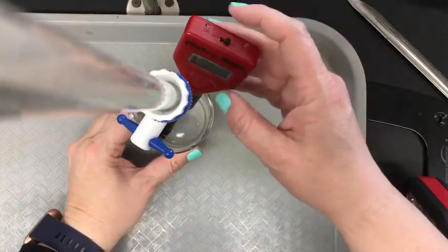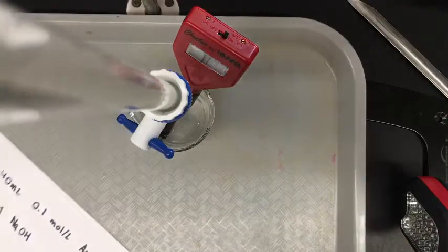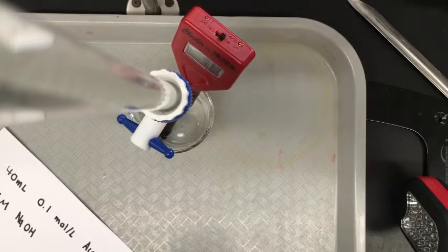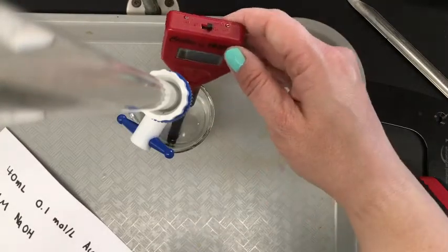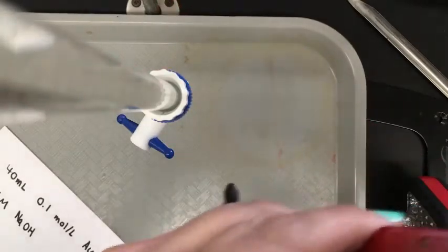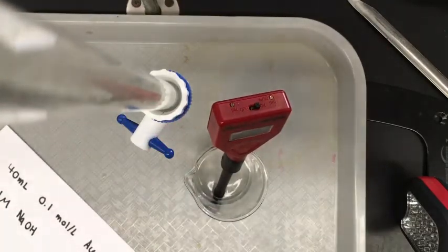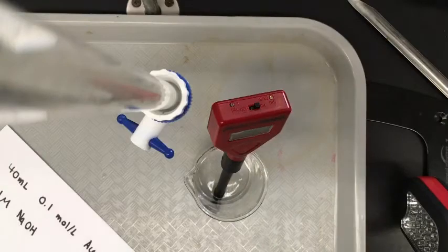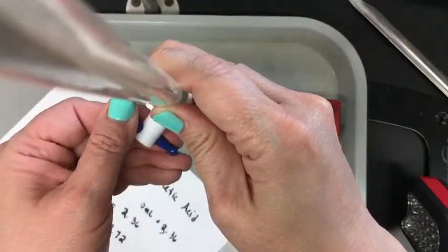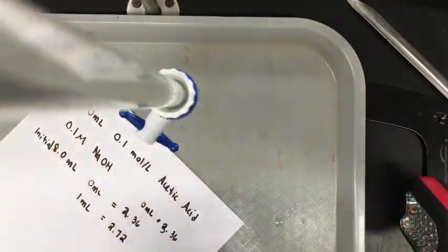So our initial pH currently at 0 milliliters of base added is 2.36. Then I'll add increments as we go. Add another milliliter very slowly. Okay, so now I've added a second milliliter. Do another swirl, take another reading.